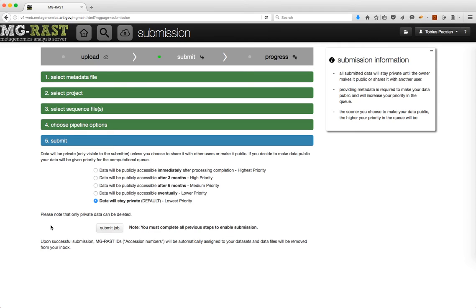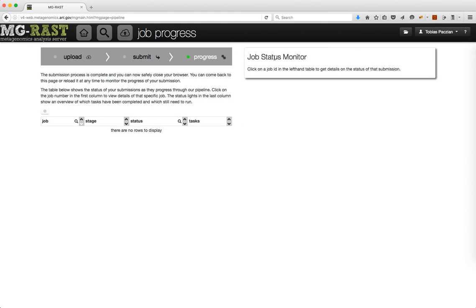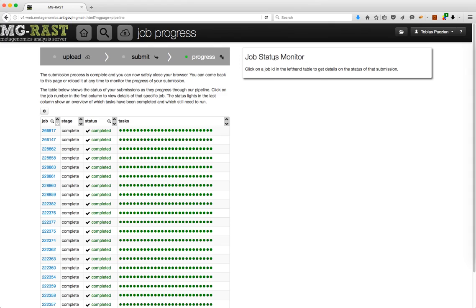When your submission is complete, you will be forwarded to the pipeline page, which will show you the progress of your data through our pipeline. Once your job is complete, you will also receive a notification via email.